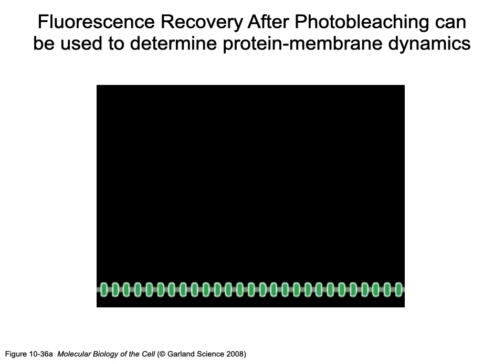If it is one that's anchored or in association with other proteins, we're going to see a different distribution pattern. Ones that are in a lipid raft would not have as much movement as ones that can dynamically move throughout the whole plasma membrane. Ones that are anchored to something like the cytoskeleton are going to be much more localized.